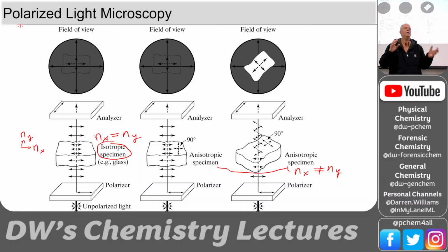The way you would tell is using cross-polarized microscopy. So look at my fingers on the video. You can see them going this way. You see how they cross each other. And so fingers this way would let light through these slits. So vertically polarized light could come through here. If I have another polarizer, horizontally polarized light could get through here. If I cross them, no light gets through, because this lets vertically polarized light through, and that's blocked by this one.